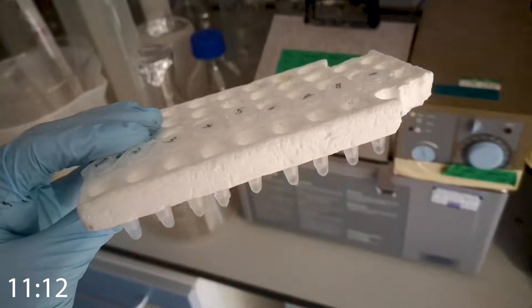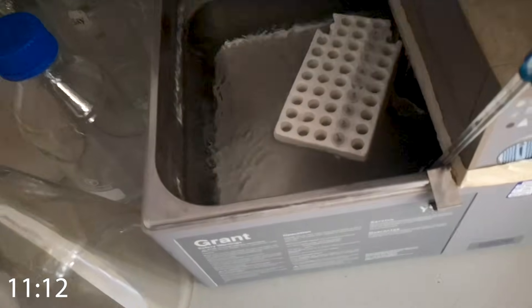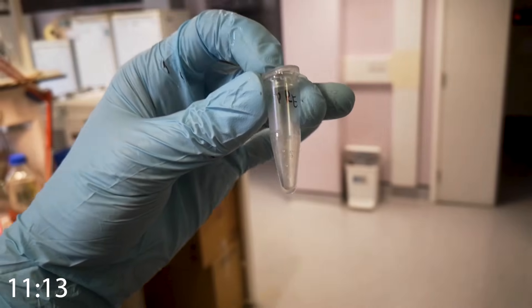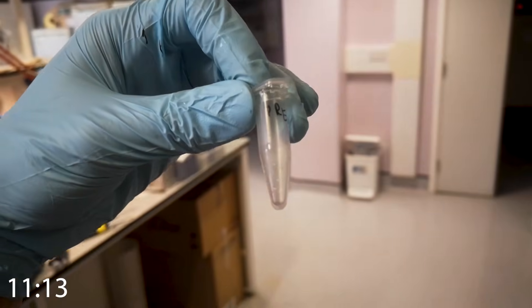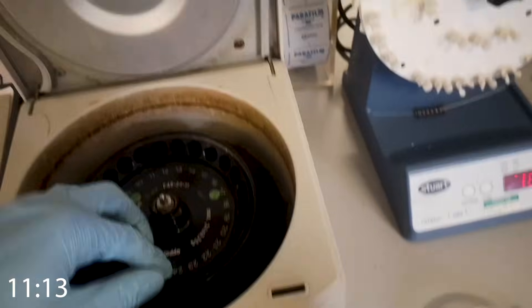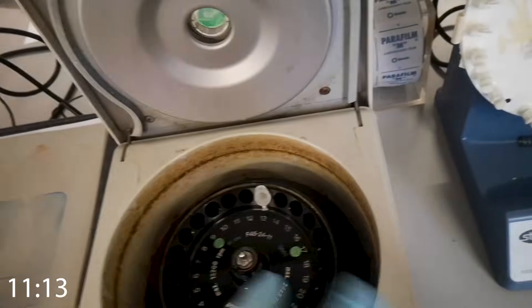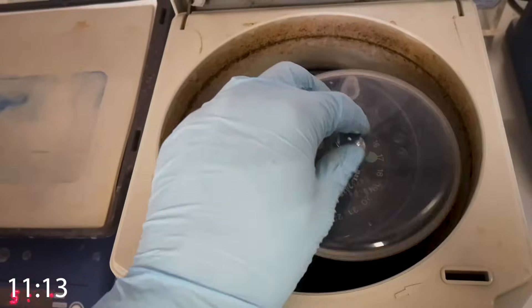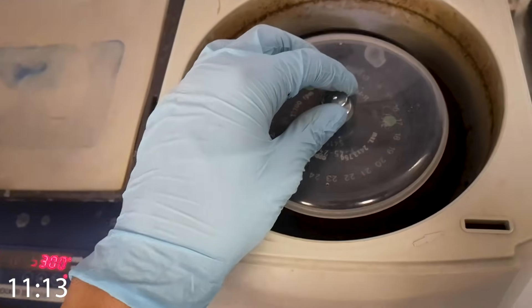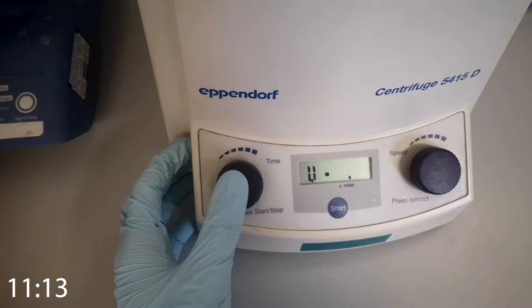We're now going to put our reactions in the incubator. It's going to be in here for three hours at 37 degrees. If you've got some liquid in an Eppendorf tube and it's not all at the bottom, what you can do is put it in the centrifuge. Make sure to balance it. This was actually embarrassing, I was just so incompetent. And then you spin it.